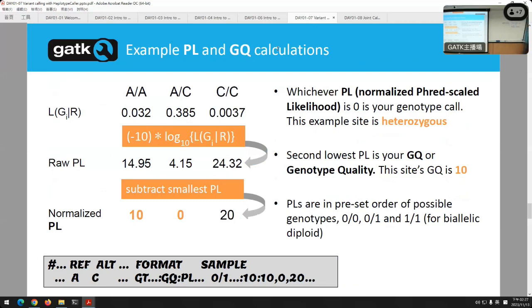That's still a lot. When we see 30x coverage, usually you see genotype quality is like 99, which is the max. So you're 99.999999% confident that this is the right genotype. We still make mistakes, but yeah. Okay, this is pretty complicated. Questions?